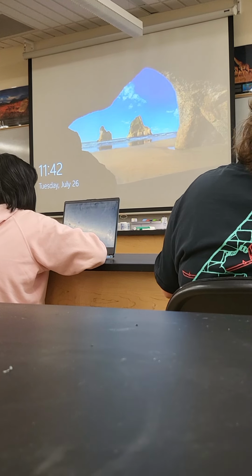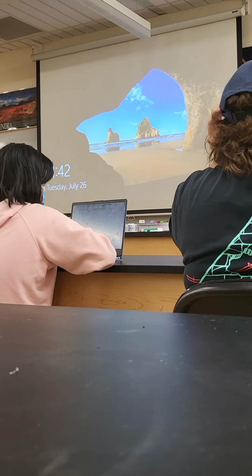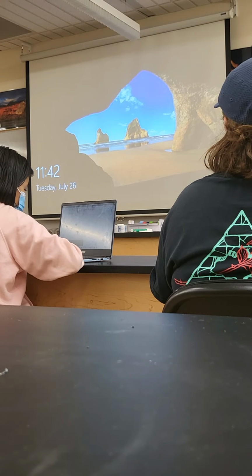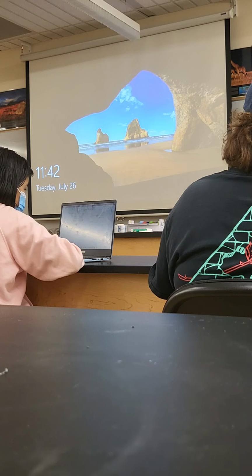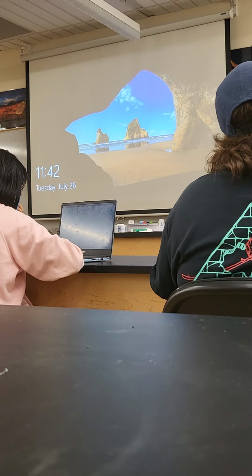As you know, from doing it the first time, you'll do your best to pick however many you decided to pick onto each of the plates. And if you can't get them all, I'm happy to come and help you. So if you wanted to have like 5 worms or something like that, and you can only get 2, I will help you get the other ones so that we can set up your paralysis pathway. Okay, so that's the plan.